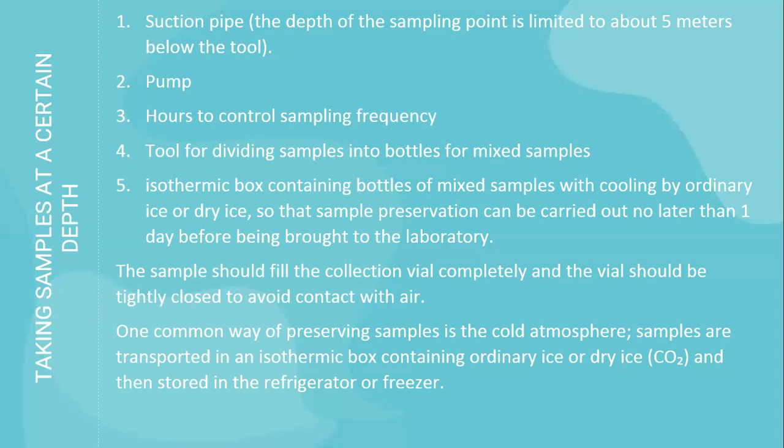The sample should fill the collection bottle completely, and the bottle should be tightly closed to avoid contact with air. One common way of preserving a sample is the cold atmosphere. Samples are transferred in an isothermic box containing ordinary ice or dry ice, carbon dioxide, and then stored in the refrigerator or freezer.